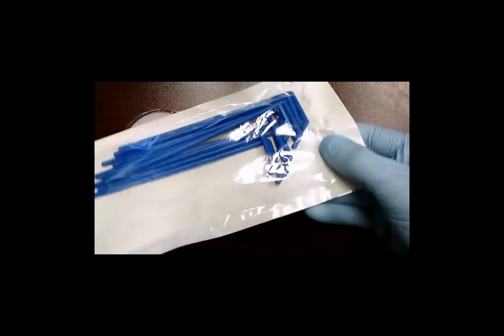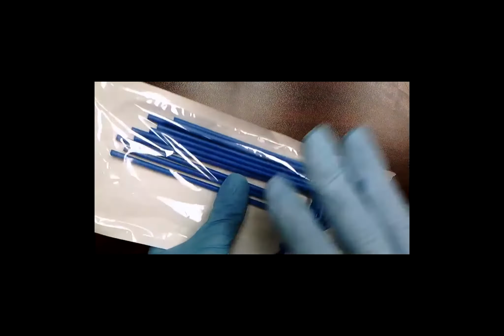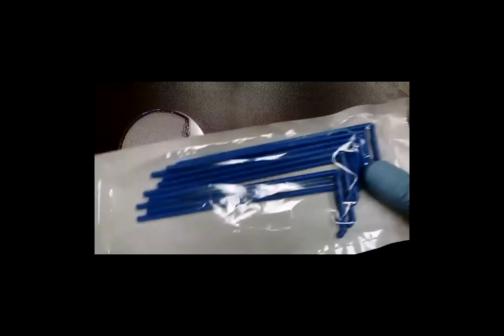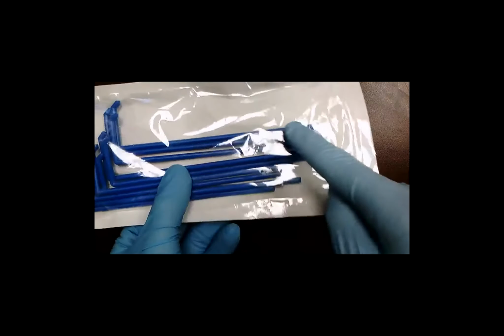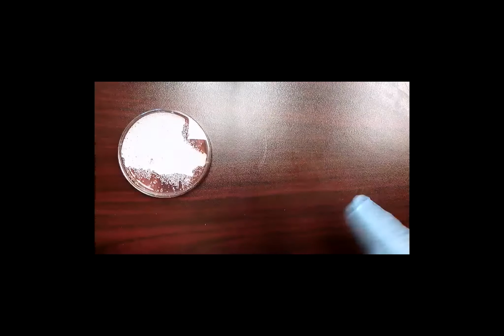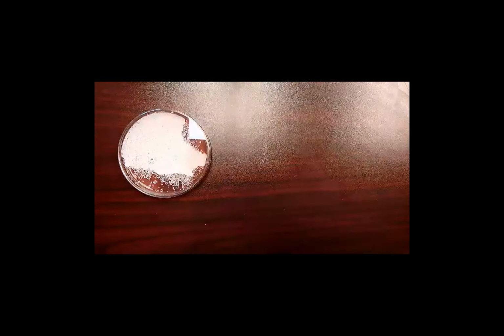Now, the kit also comes with little plastic hockey sticks, which are called spreaders. These, again, have been sterilized and are in this package. Once you open it, you risk contamination. So the handle end is the long, straight end. The hockey end part is what you're going to use to spread that water evenly on your plate. So you have to open the package.